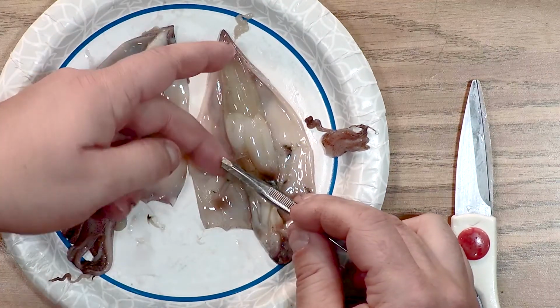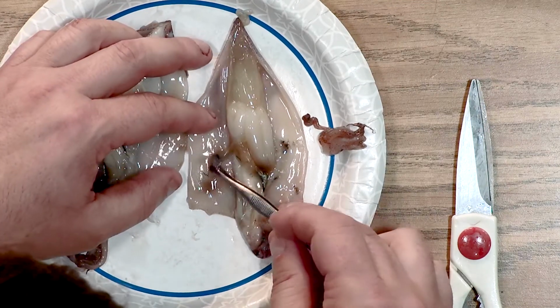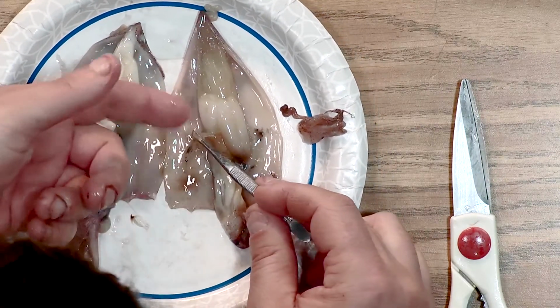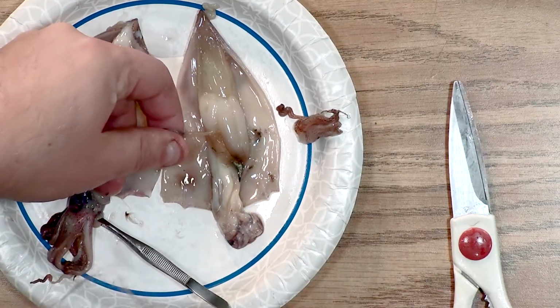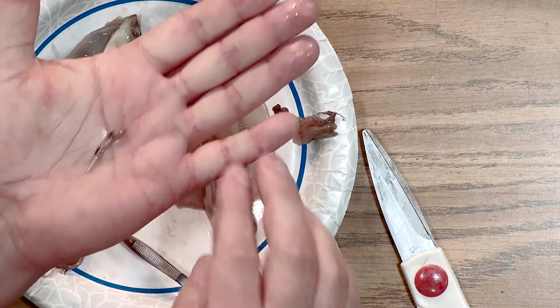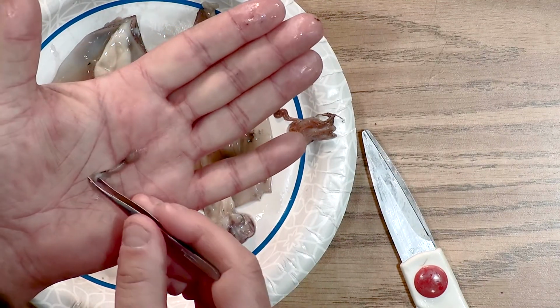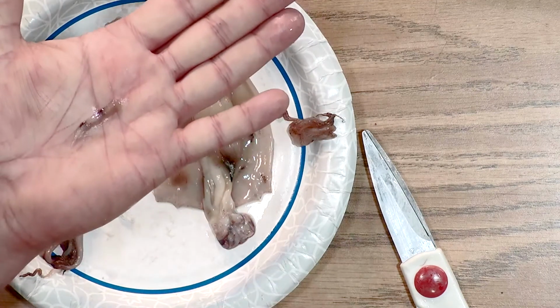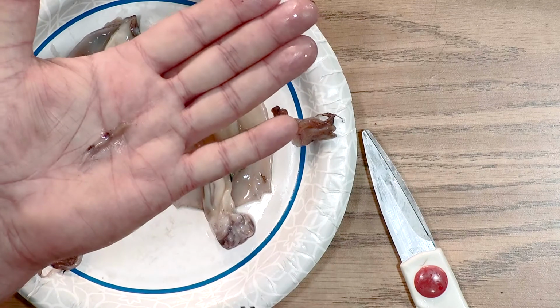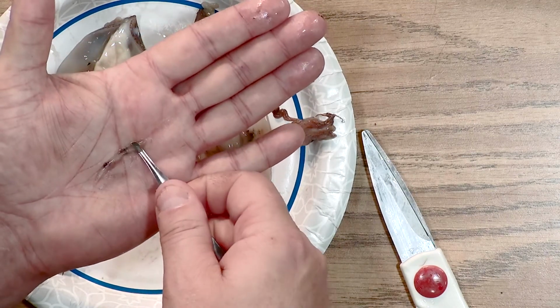All right, so this gill or lung sac here, I'm trying to separate it from the body a little. And it breaks. Awesome. Okay, what I'm going to do here is I'm going to use my scissors to cut this, and I'm going to put it in the palm of my hand so we can kind of look here. And now some of that black stuff hung on here, but this is pretty amazing. This organ has its own heart to control it. That's just phenomenal. This creature has 3 hearts.